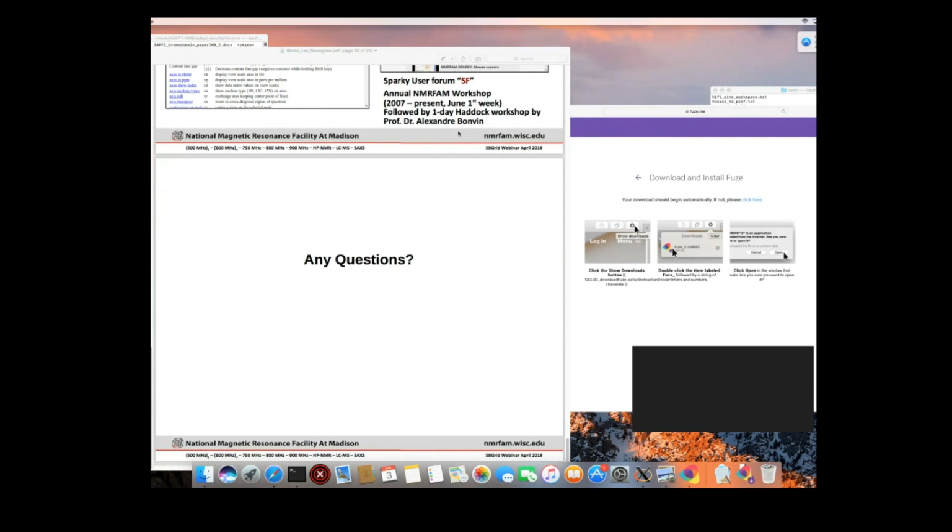I had a couple of questions. One, so for iPine, the automation tools, everybody's data is always, we all want ideal data, but we rarely get it, right? So let's say you've got a little conformational heterogeneity, or let's say you have other issues. What would you say would be the things that trip up the automation, and what gets handled pretty well?